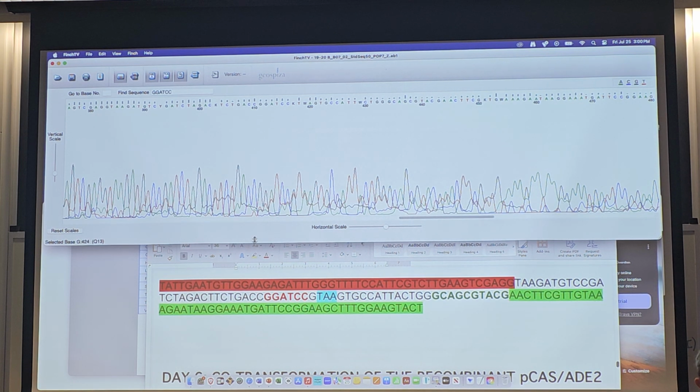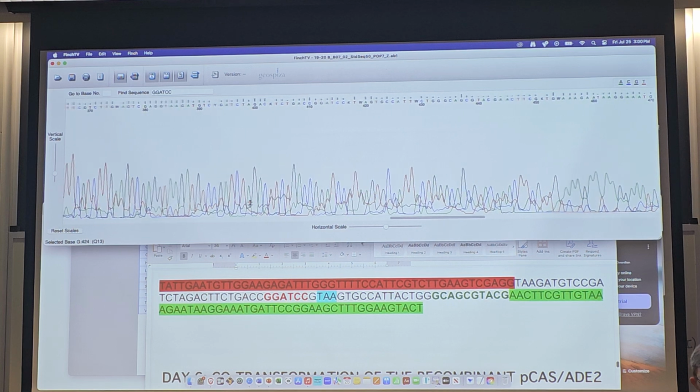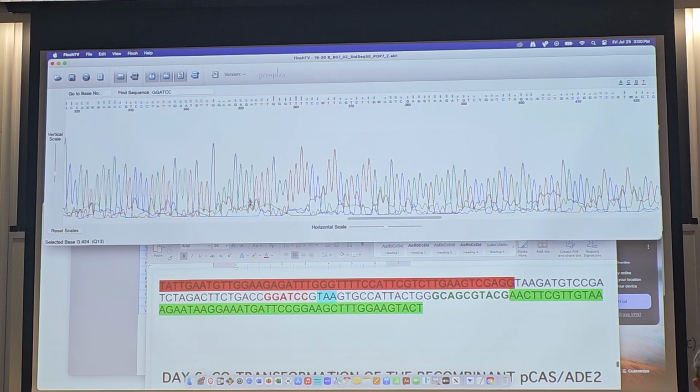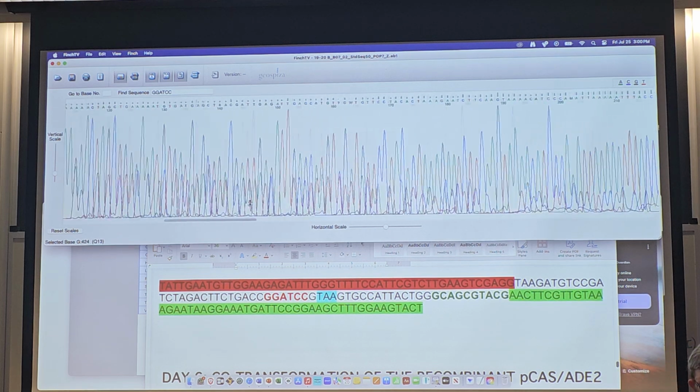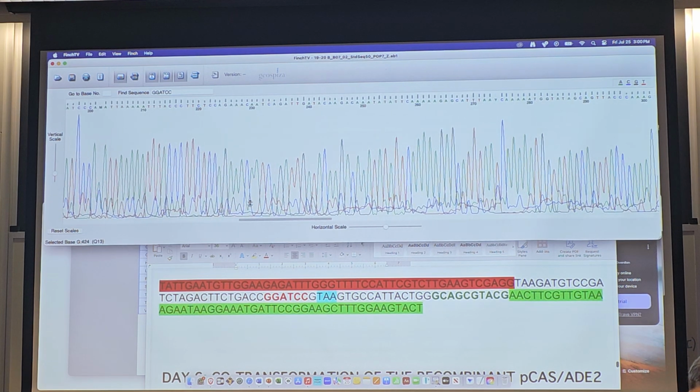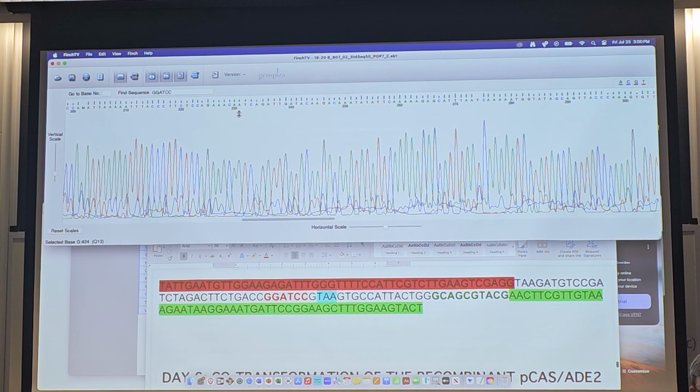So what we're looking at here is the sequence again of one of Nicole's 2 clones, so we would expect that this would have the insert. And you can see down here, this is 230, 240 nucleotides, and this looks pretty good. This is really good sequence. Now you can see some background underneath it. You see that? That's like a secondary sequence underneath our actual sequence.